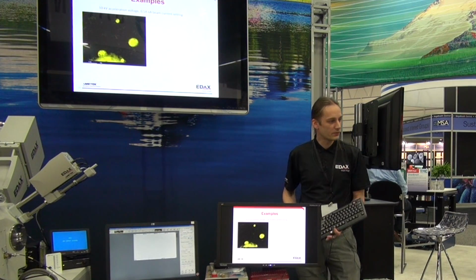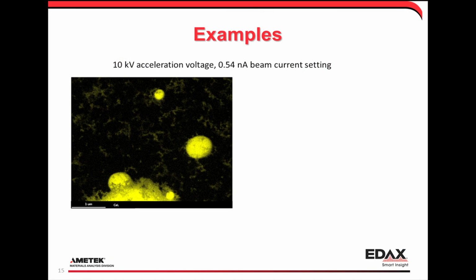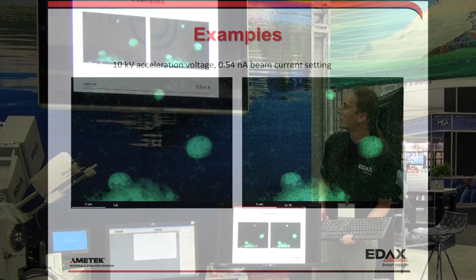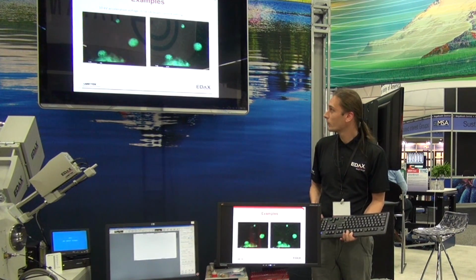Cerium, we have a couple of different options for when we're mapping that. This is the L-line map. We also have the M-line map. This doesn't look very nice compared to the other one. And that is because if we look at the spectrum, I'll just go lanthanum, we have the same story, lanthanum L, lanthanum M. You have a lot more noise in the M-line map.